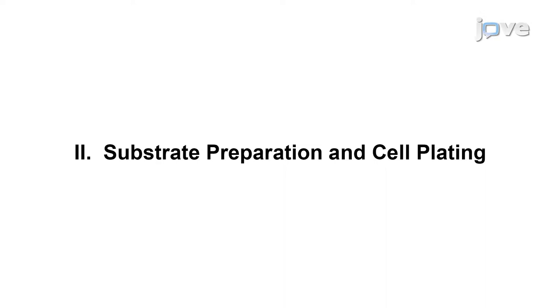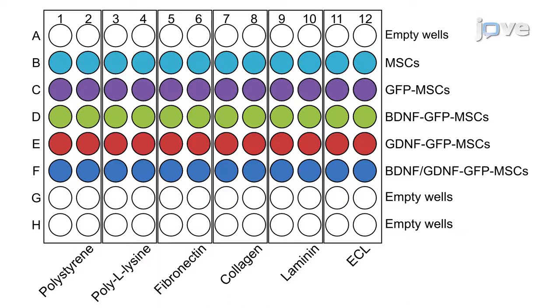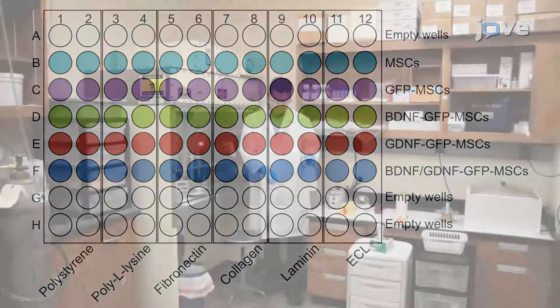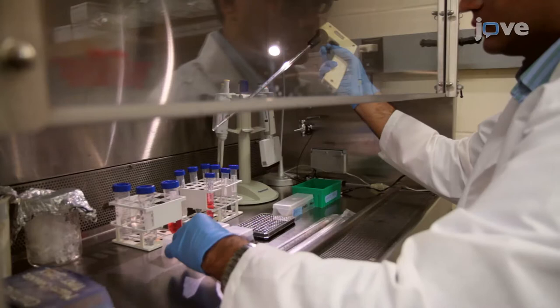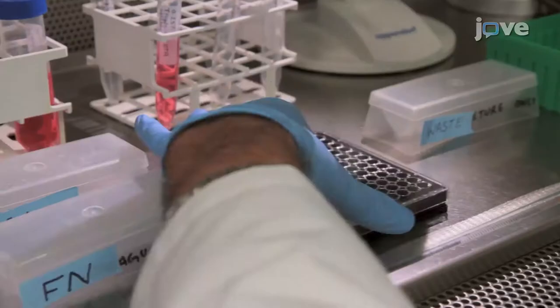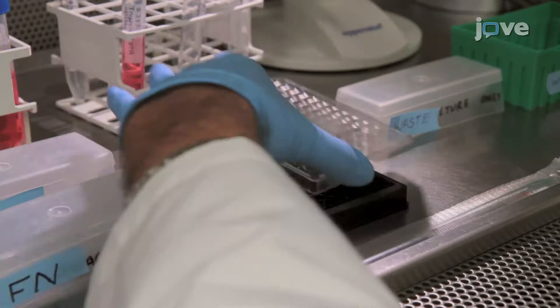To begin, create a map, as shown here, of the 96-well plate outlining the different substrates and cell types to be examined. Under a sterile culture hood, prepare a workstation with different substrates and a 96-well plate. Add 100 microliters of substrate solution to each well according to the map. Then use a strip of parafilm to seal the lid and store at 4 degrees Celsius overnight.